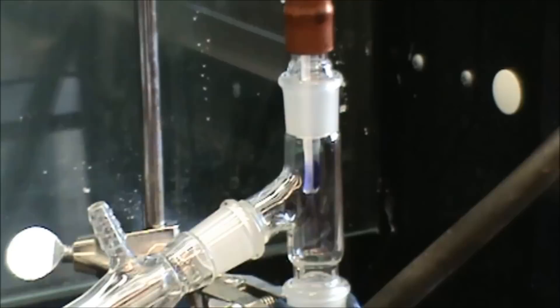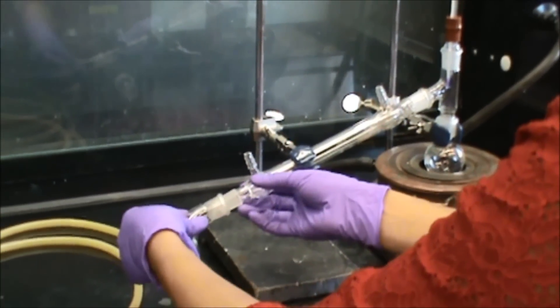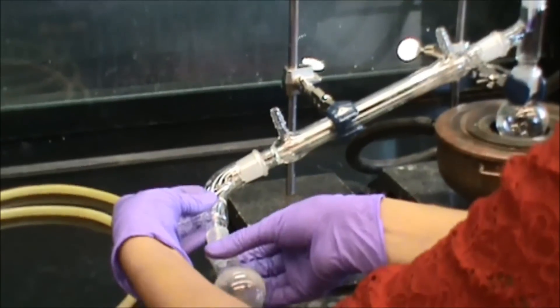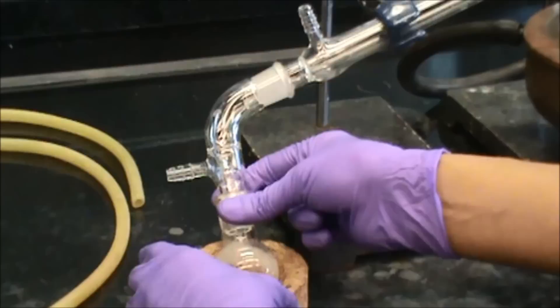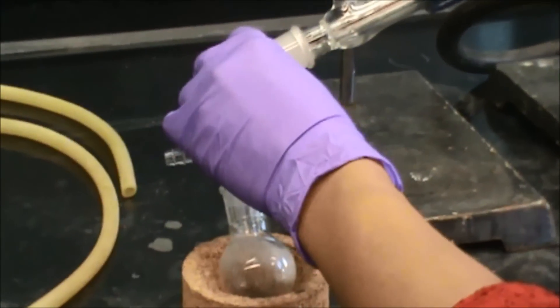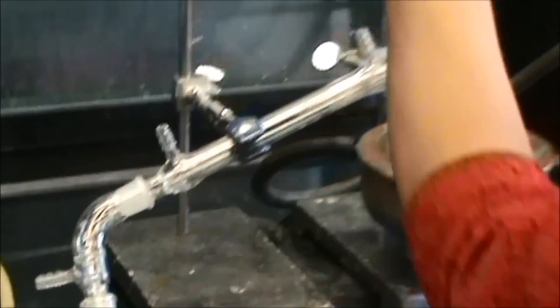Once you have this, you are going to take your bent adapter and attach it to this side of the condenser, and your receiver and attach it to the bent adapter. Make sure you have it on a stand like this to make sure everything is intact. Now take your rubber bands.